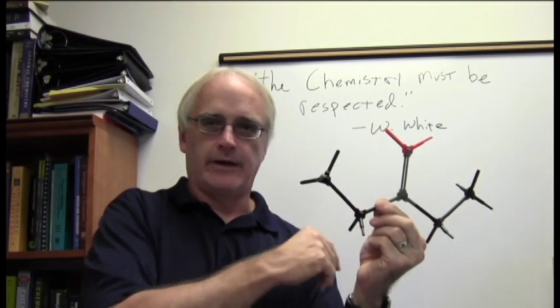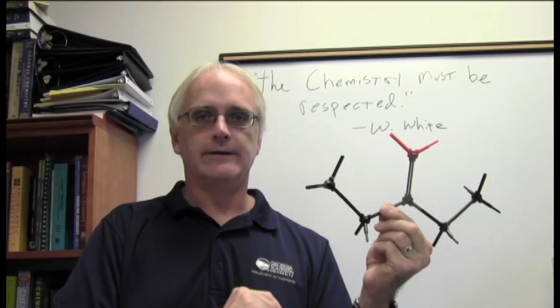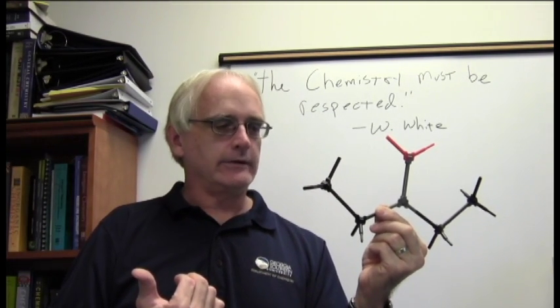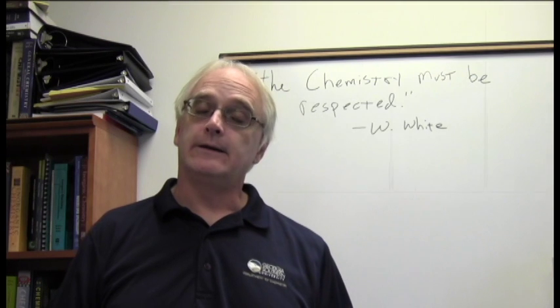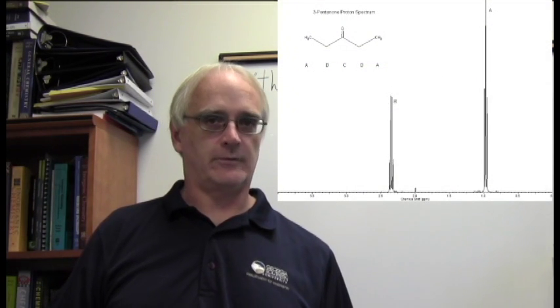These 2 carbons and the 4 protons attached to them will also form one distinct group. And so while it's a larger molecule than methyl ethyl ketone, it actually only is going to show 2 distinct groups in its proton NMR spectrum, and indeed that is exactly what we see. Larger molecule, but a simpler spectrum.